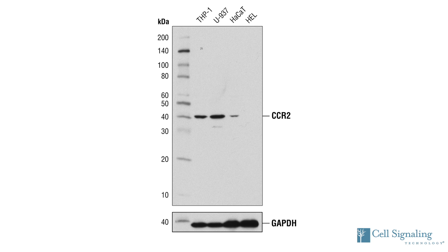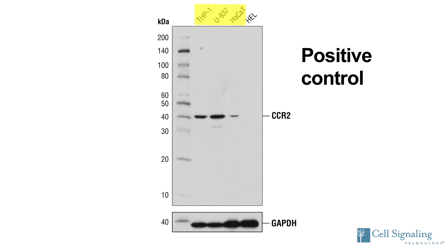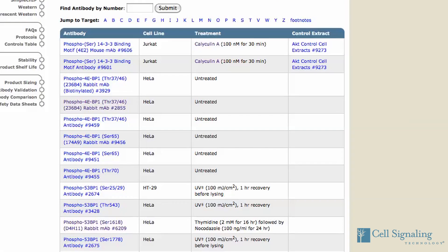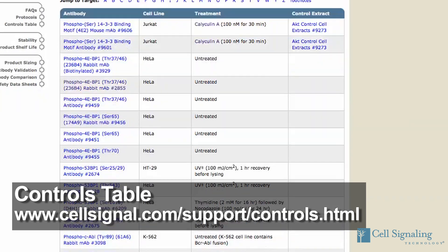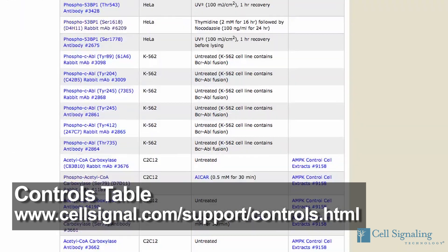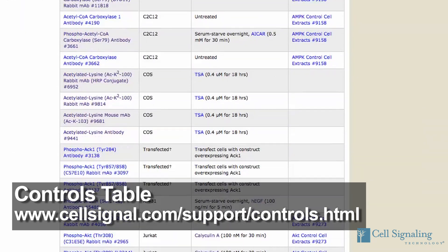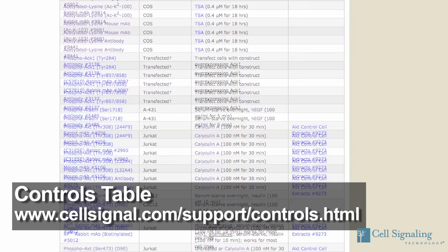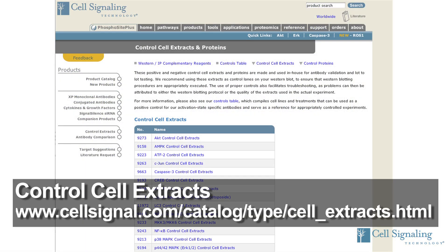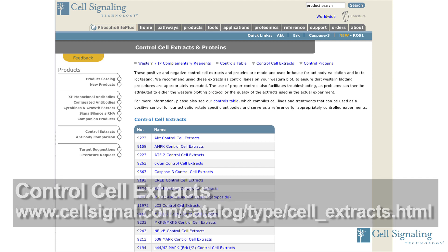CST recommends always using a positive and negative control with each experiment. CST scientists have compiled a useful controls table that can be used as a starting point for many of our phospho-antibodies. Control cell extracts are available to help you identify potential problems with the technique and to serve as valuable tools for potential troubleshooting.